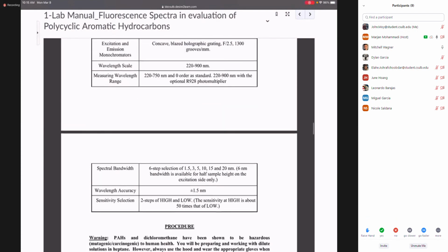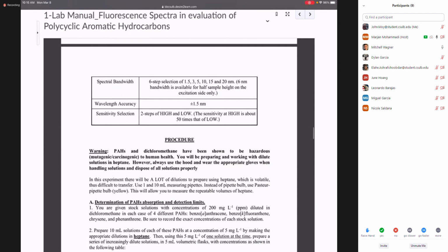Okay, let's say what we need from UV-Vis, in addition to what we are including in the lab report: we need those lambda maximum values. Again, for example, for chrysin, let me help you. If I remember it right, it was around 268, 267.